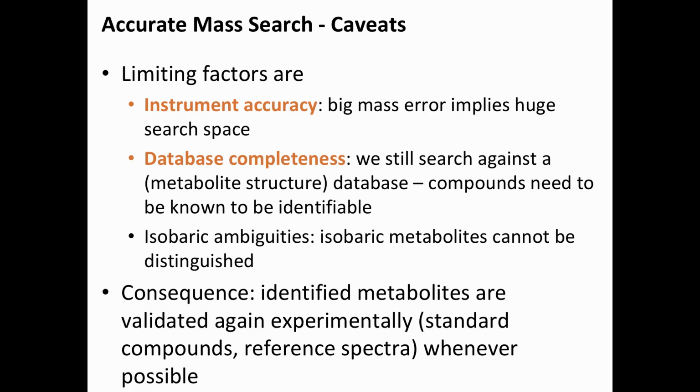If I'm always going to find these 50 in there, you just identify them with library search. You know where they come in terms of retention time, and you can actually determine the distribution of your error of these masses on your data set itself, and that gives you a better estimate than probably what your mass spectrometrist is going to tell you they see, what they expect their instrument to perform. Sometimes it's going to be bigger, sometimes it's going to be smaller than that.